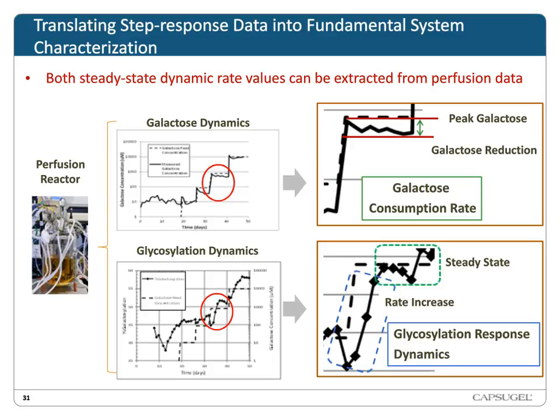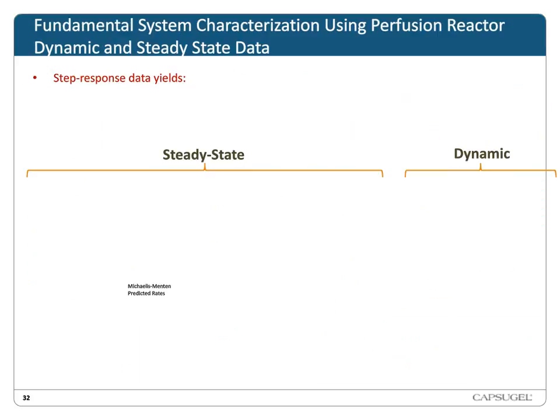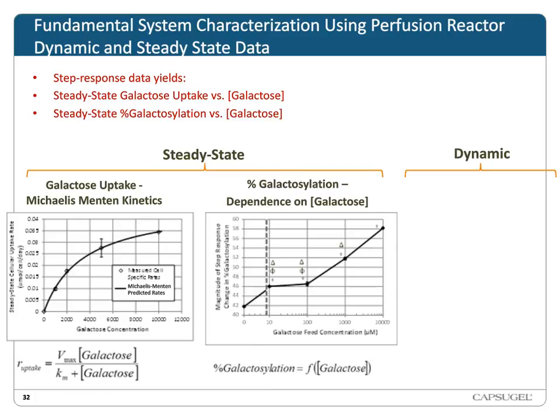But interestingly, we can also pull another piece of information out of the galactosylation data set, and that's a rate piece of information. We can ask ourselves not only where it goes when I subject that culture to a certain galactose concentration, but also how long it is going to take to get to that new steady state. These are key pieces of information when you're trying to enact a control scheme where you're trying to control things through time. The pieces of information that we're going to want to know in order to make a forecast are not only where the process is tending to go, but also how long it is going to take to get there.